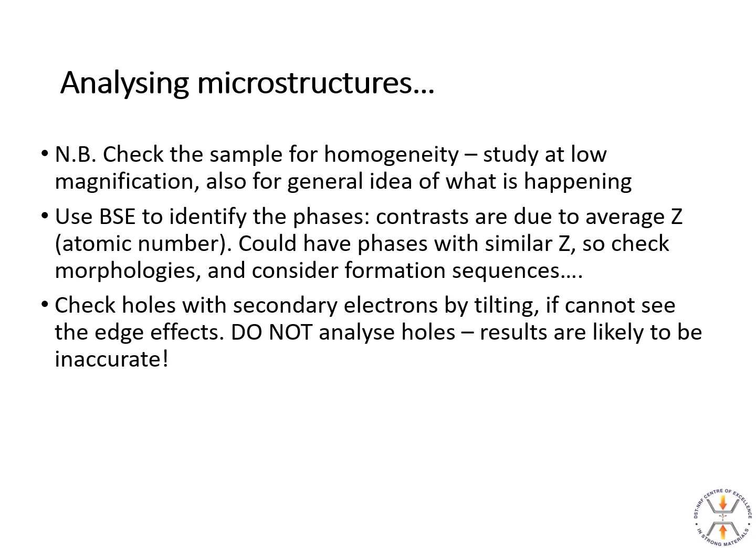So when we're analyzing microstructures, we want to check the sample for homogeneity. This is a really good idea, because is the sample what we think it is? I'll show you an example in a minute, because if it's not homogeneous, then you're going to have different areas with different compositions. And it's also good to look at the sample in low magnification, just to check if it isn't full of holes or whatever. And at the same time, you're looking for homogeneity.